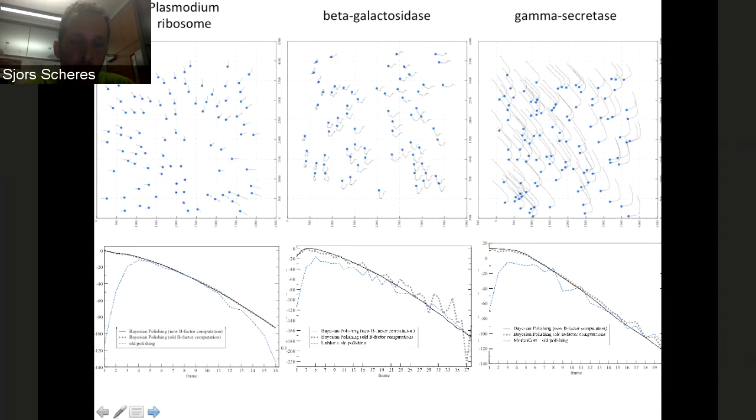But one thing that's interesting is if you look at the falloff of the signal with spatial frequency for each of the movie frames. Already in previous versions of Relion, we modeled this with the B factor, and B factors being more negative here means there is less high spatial frequency content in the images.